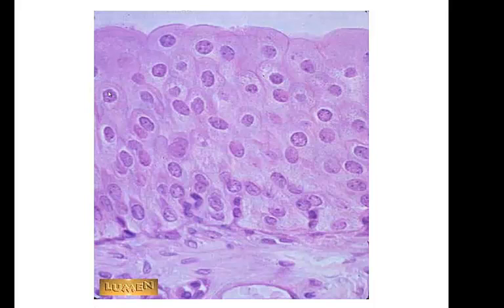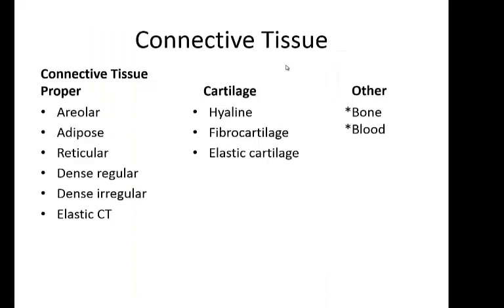And there's another transitional. That looks ridiculously familiar. Okay, dome-shaped cells at the top. And we have our transitional. So distensibility is the function, and a good location would be the bladder. So we'll stop it there.